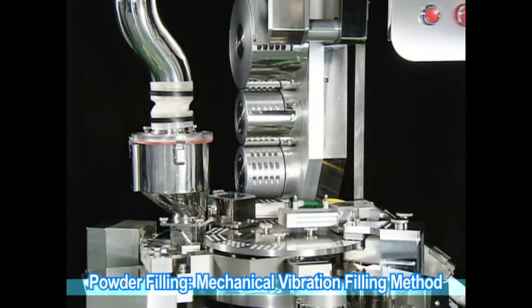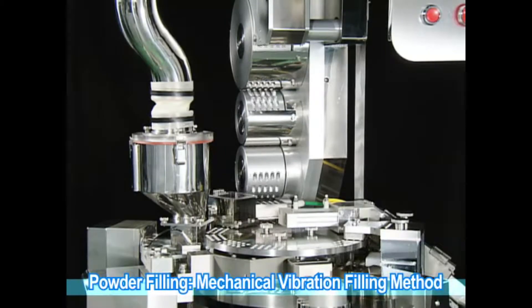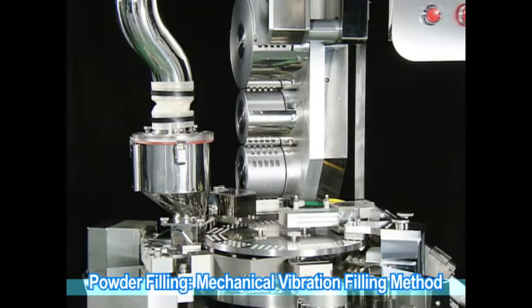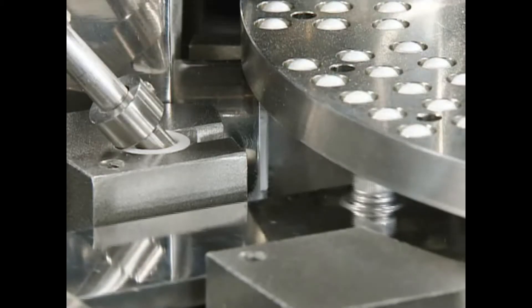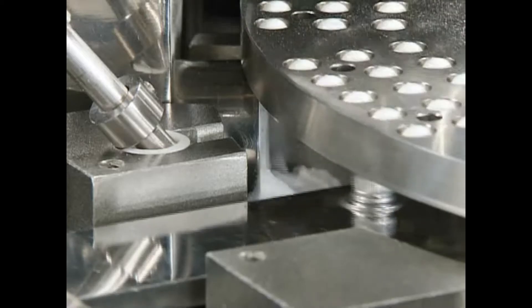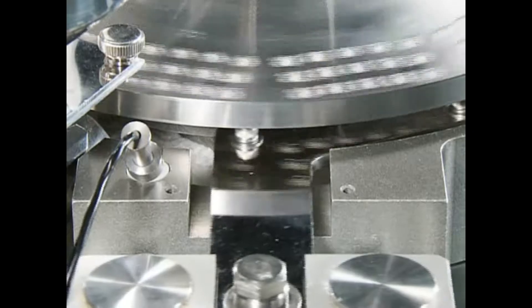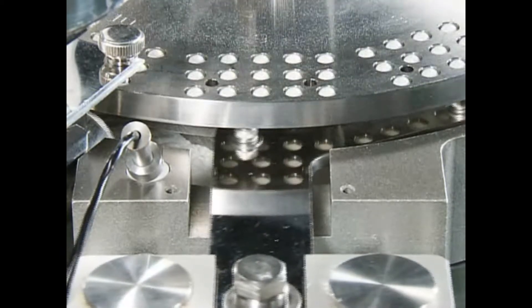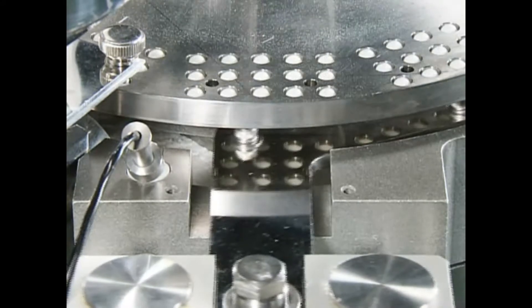The built-in level sensor adjusts the powder layer to a stable level. Direct filling into the capsule body with Qualacap's unique mechanical vibration method makes for the superior filling of powders that are difficult to form into slugs or with high adhesibility. A spring plunger allows adjustment to a given strength after filling, improving filling accuracy by pressurizing the powder to a consistent density.